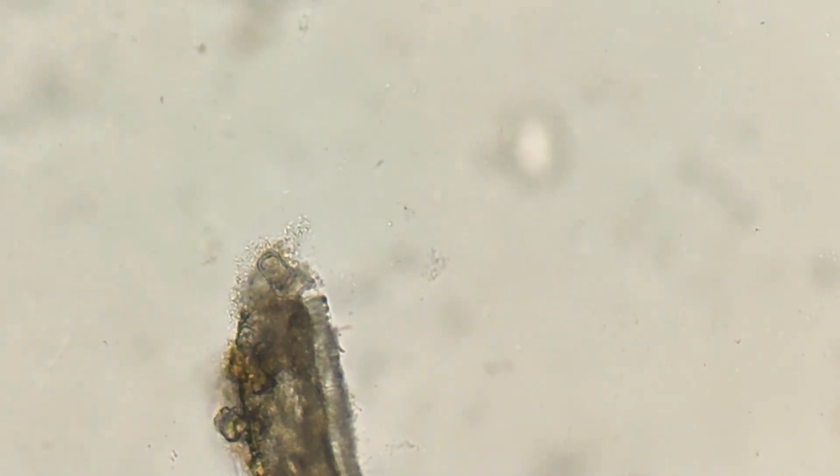It is so beautiful to observe the bacterial cells seeping into water through the cut ends. If we use a wilt-infected sample, the cut is made in the collar region to observe the bacterial streaming. This is again the infected carrot tissue from which the bacterial ooze formed so beautifully. You can observe that in the video.